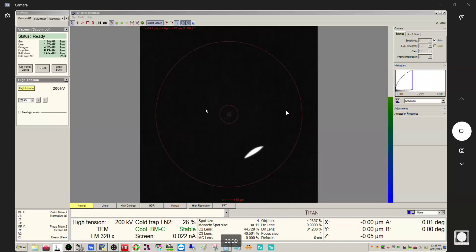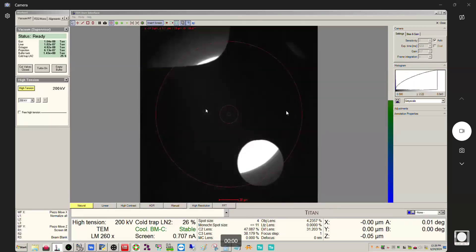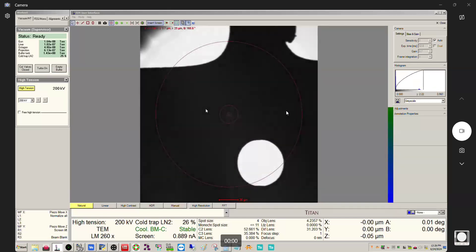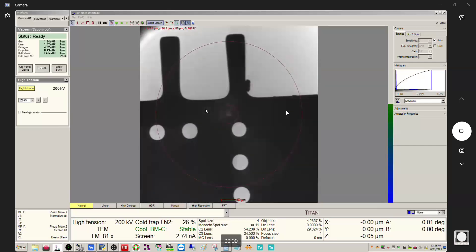And now we're seeing something. Once you start to see something, you can use your beam manipulation tools — the trackball or the intensity knob — to manipulate the beam. What we can see here is that yes, we were over — or we had in the beam path — the grid, which is why we weren't seeing anything. We had to mag down and spread the beam out far enough.